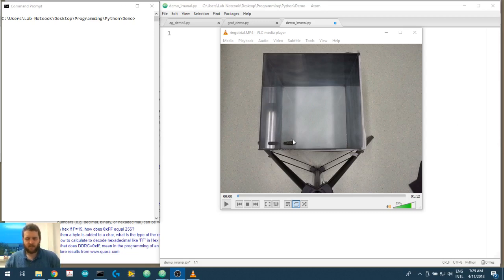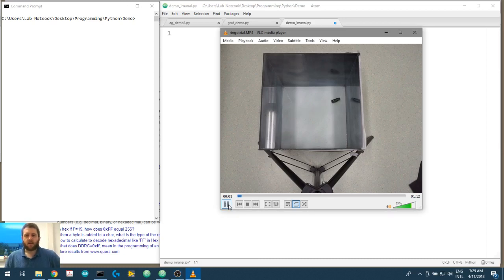In this case, for these sets of videos, we are going to use a robotic beetle. This robotic beetle is called Ringo. I just got it off Amazon, and here is the video that we get out. It's only a short one here, but the point should still come through. So here we have a fixed arena, an open field arena, and we have an object inside that arena that we want to analyze. For this video, we will analyze its position relative to the arena itself.